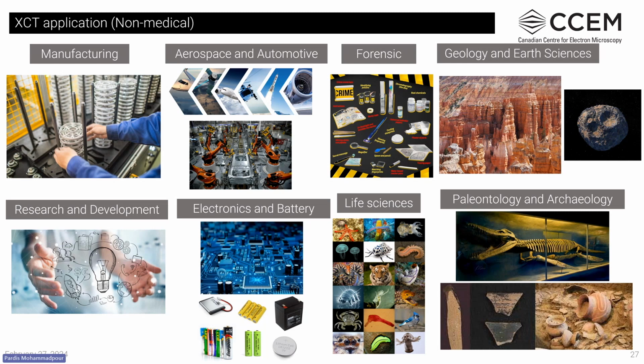In R&D sectors, XCT is utilized in various scientific disciplines like physics, chemistry, biology, and engineering for non-destructive 3D analysis. It can be used in electronics and battery industry or research to inspect the internal structure without disassembling the part.